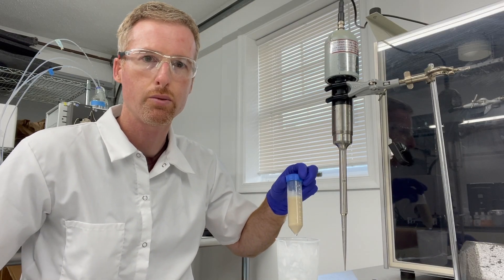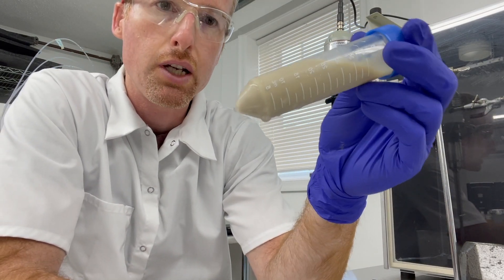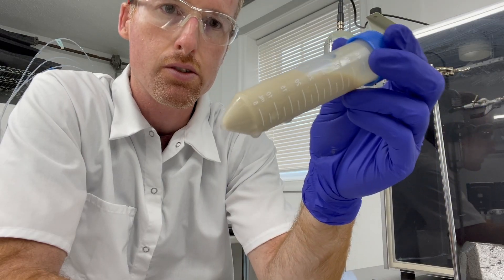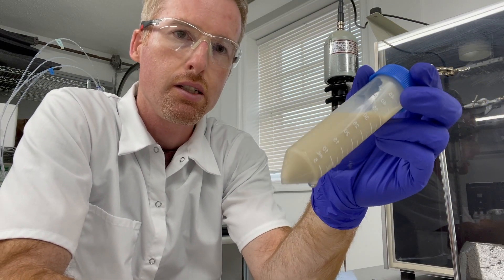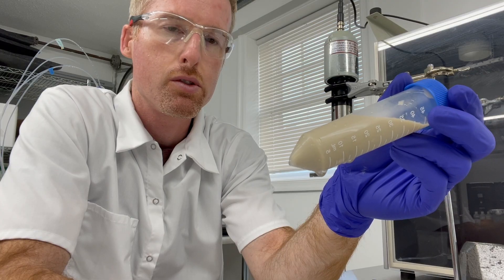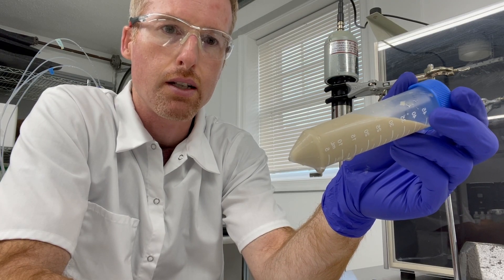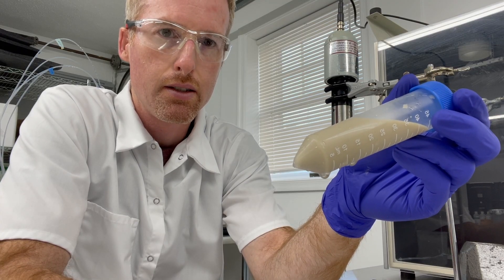Okay, so here we are at the sonicator, and you can see that the cell pellet that I thawed before has completely thawed. There are no lumps in solution and it's about the consistency of a milkshake, and that's important. We don't want it to be too thick, because if there were too many cells it would turn into a jelly while sonicating, and then it wouldn't mix and it wouldn't lyse completely.